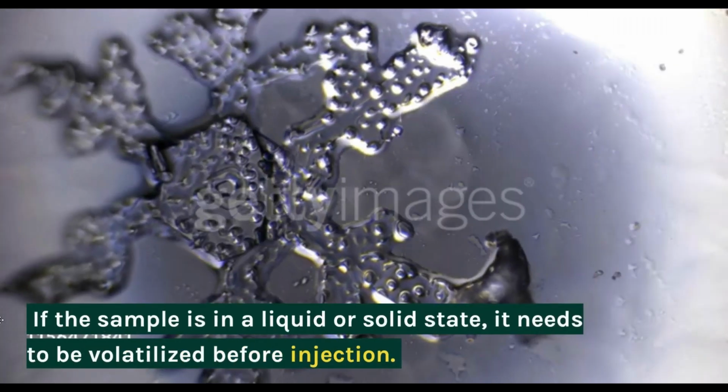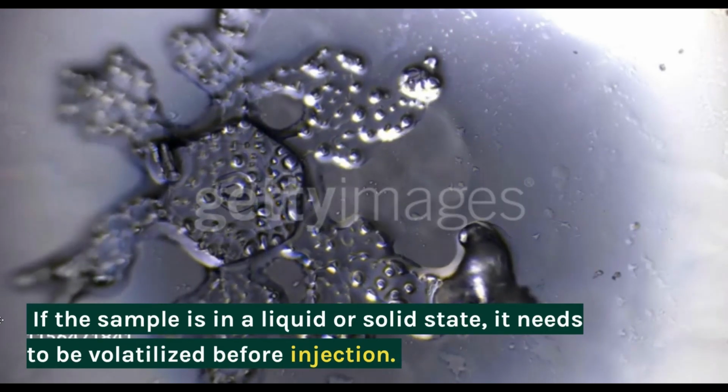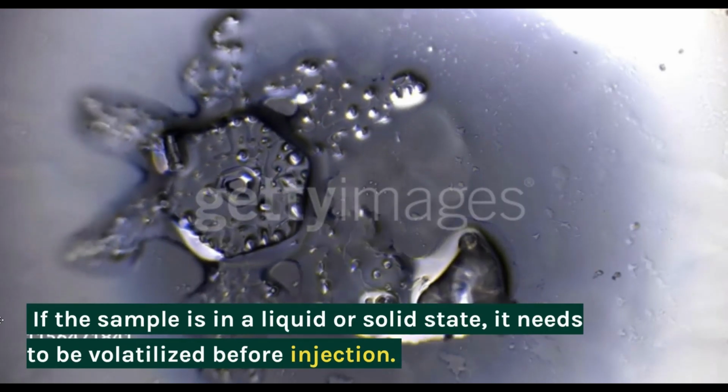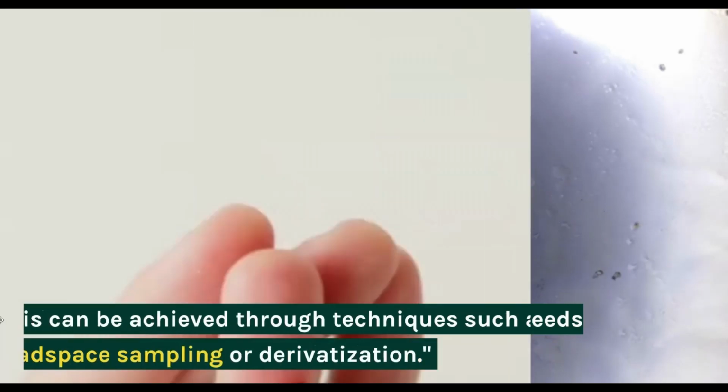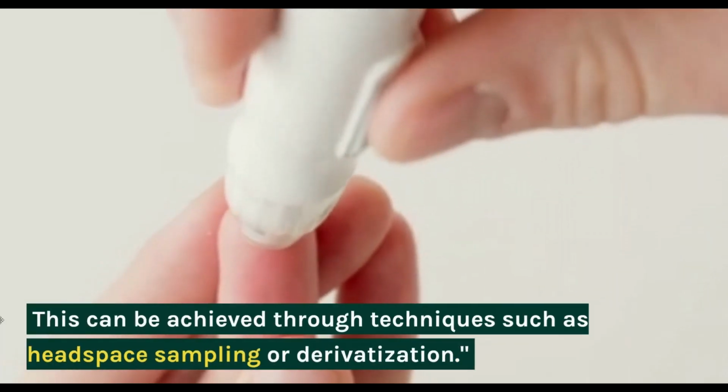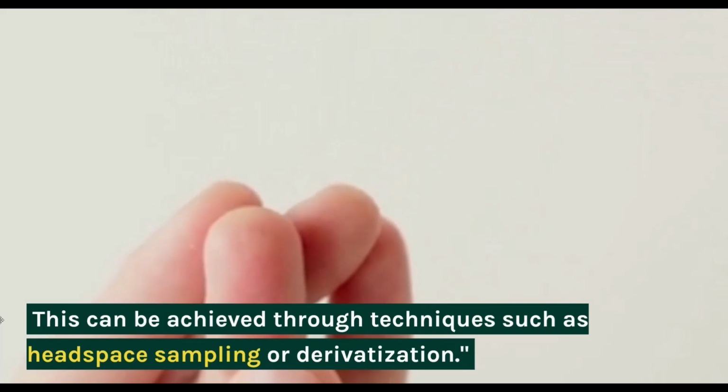If the sample is in a liquid or solid state, it needs to be volatilized before injection. This can be achieved through techniques such as headspace sampling or derivatization.